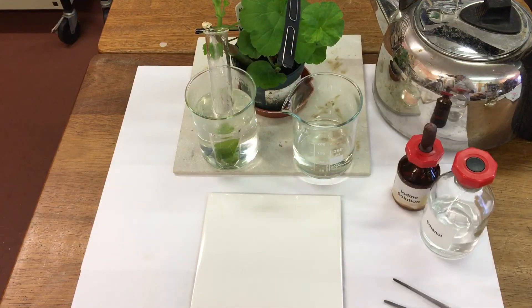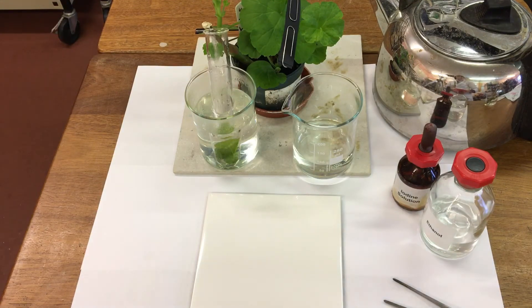And all the chlorophyll that's in the leaf will leak out into the ethanol and the colour will start to change.